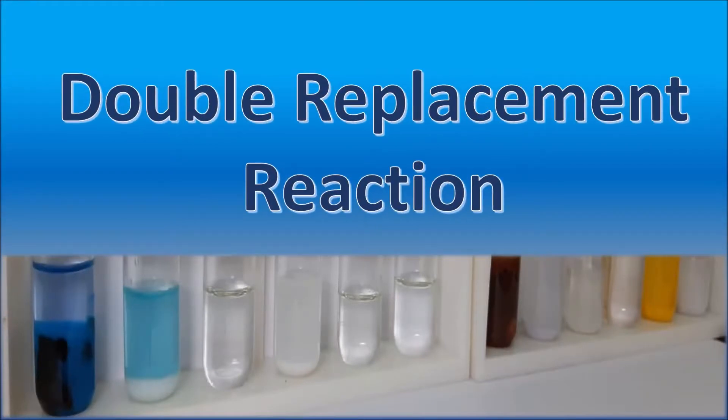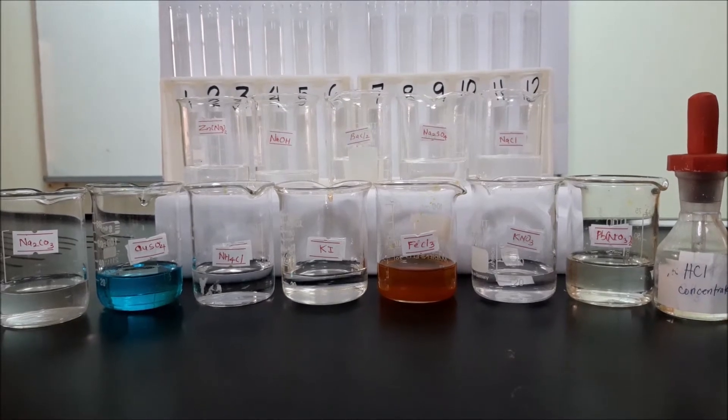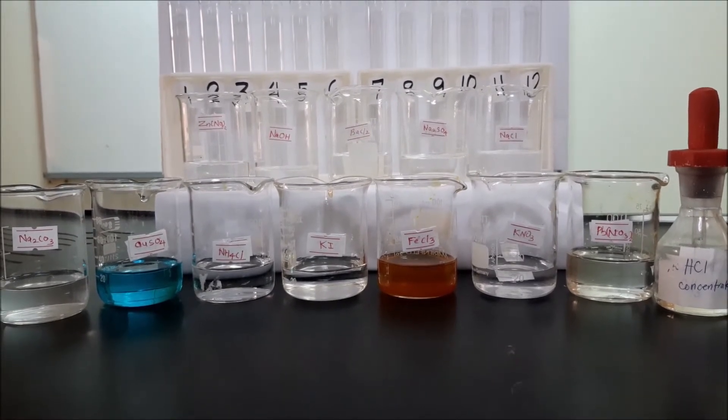In today's experiment, I will show you double replacement reaction. Today we will do an experiment about double replacement reaction.